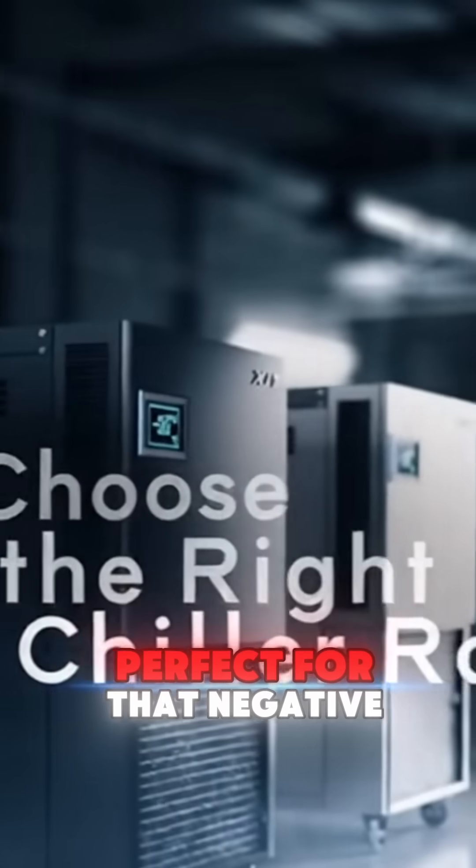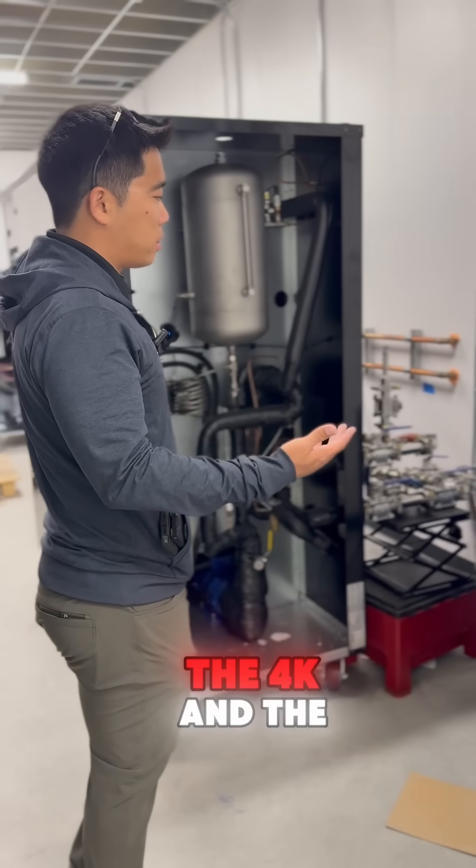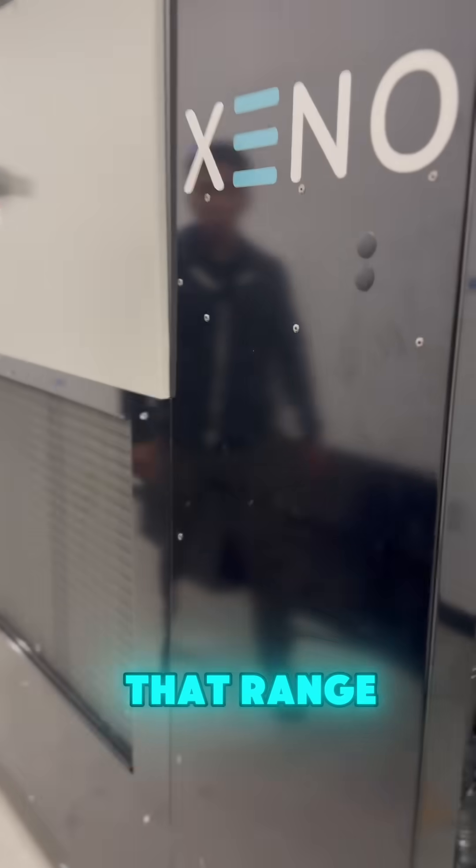For chilling, our XST series is perfect for that negative 50 range. We have options like the 4K and 6K units with plenty of cooling power to keep your solvent and columns locked in that range.